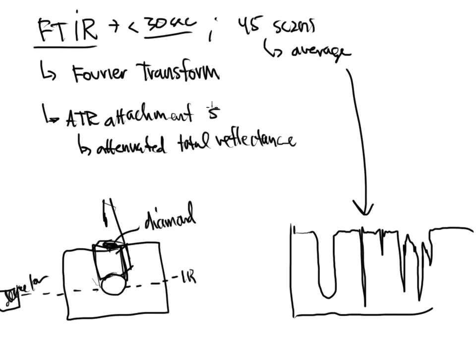This ATR attachment cost us around $18,000. The FTIR was another $25,000 on top of that. And the reason that we purchased the ATR attachment is because this is very well suited for solids and for liquids. It shortens my sample prep time tremendously.